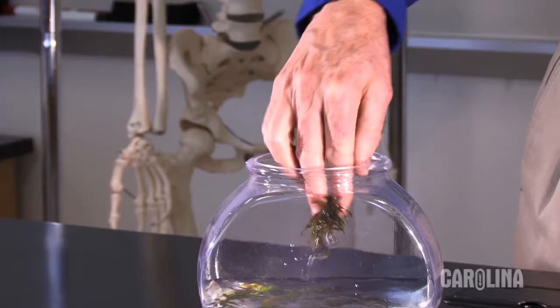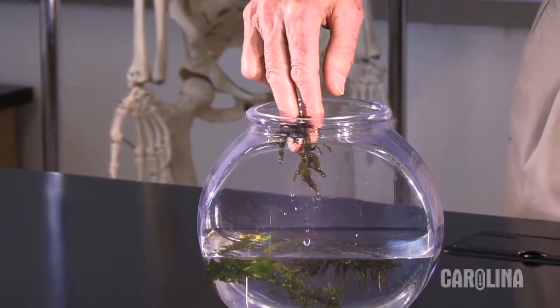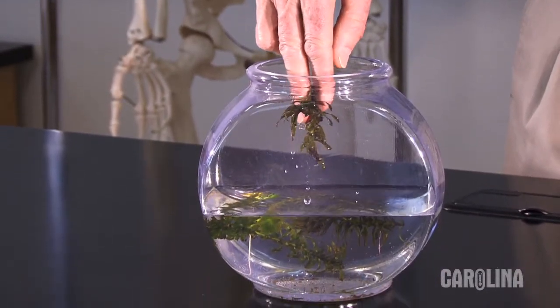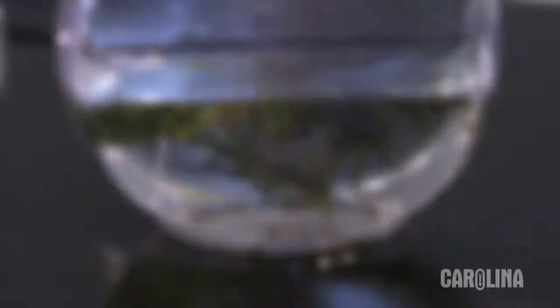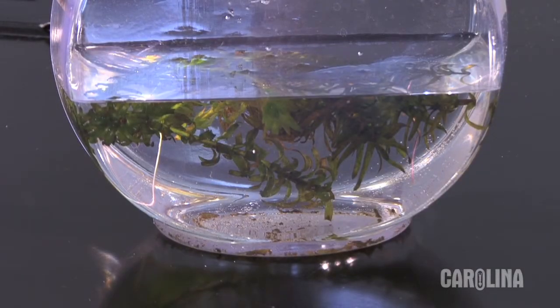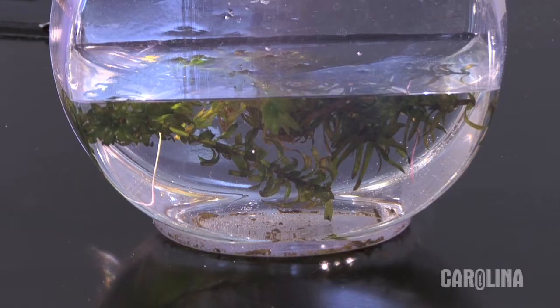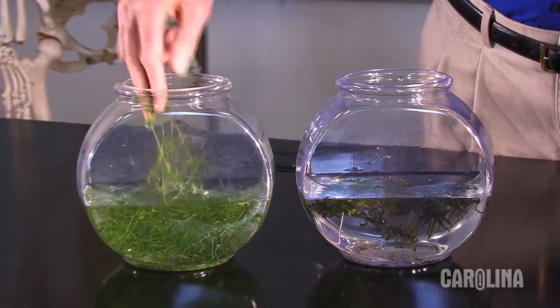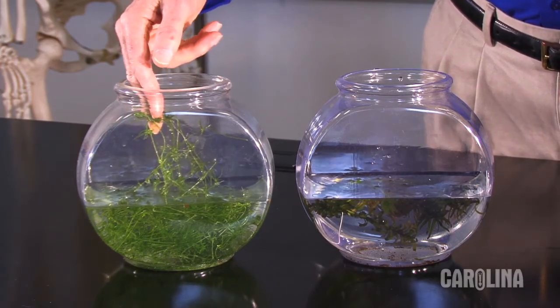Elodea, an aquatic plant also called waterweed, is often used to study photosynthesis. Unfortunately, Elodea densa is non-native, and some states ban Carolina from shipping it, so we'll use Cara, a native plant that isn't invasive.